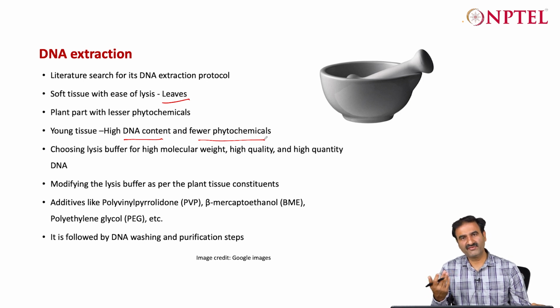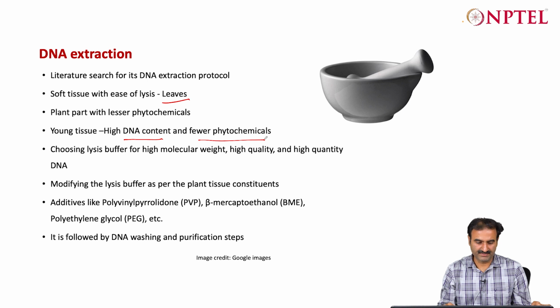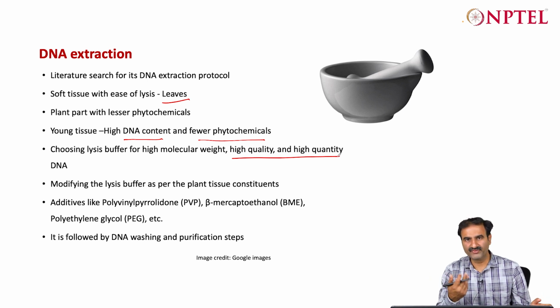So if the DNA is already fragmented, even if the technology is promising and can give you longer DNA sequencing, if your initial DNA is fragmented, it will not be good. So high molecular weight and high quality DNA are both required. High quality also, because if it is full of impurities, it will block the nanopore pores, or basically interfere with the sequencing enzymes or process.